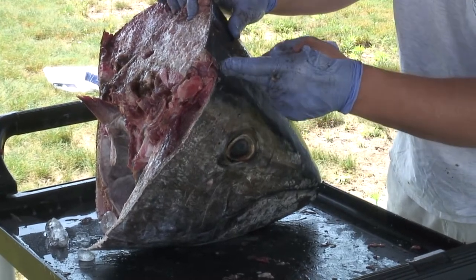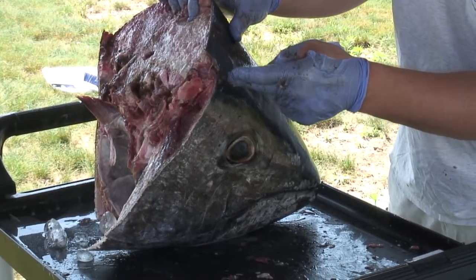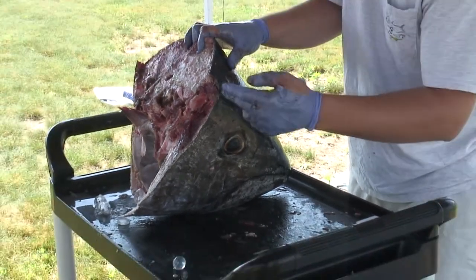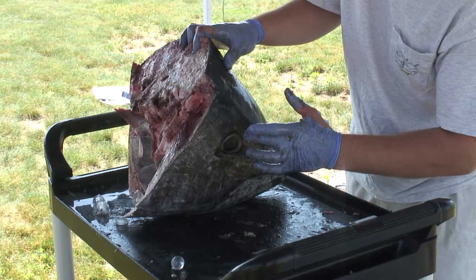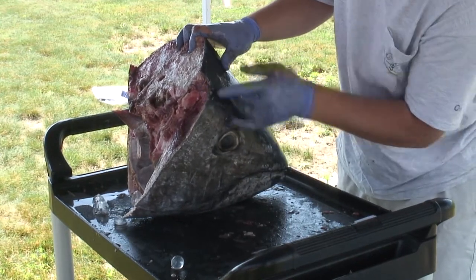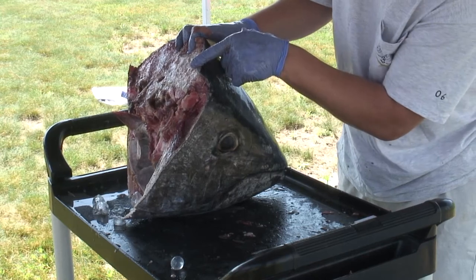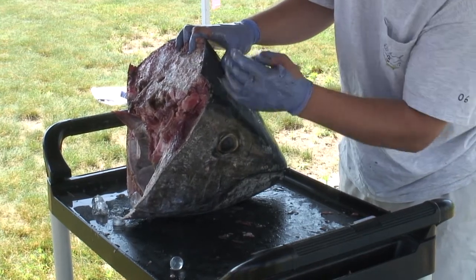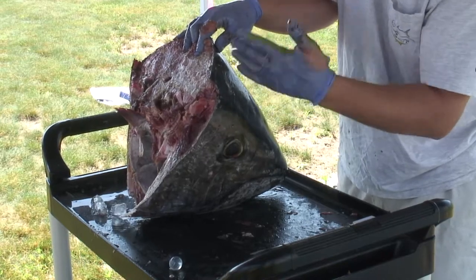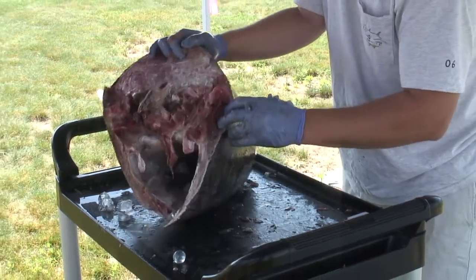If you cut the head off of the tuna and you're in the recreational permit category, or the commercial category for that matter, you want to try to leave about two inches of space between the back of the eye and the back of the cut. If you don't and you cut it up here, what you'll do is you'll cut right through that cavity and you'll destroy the otoliths.